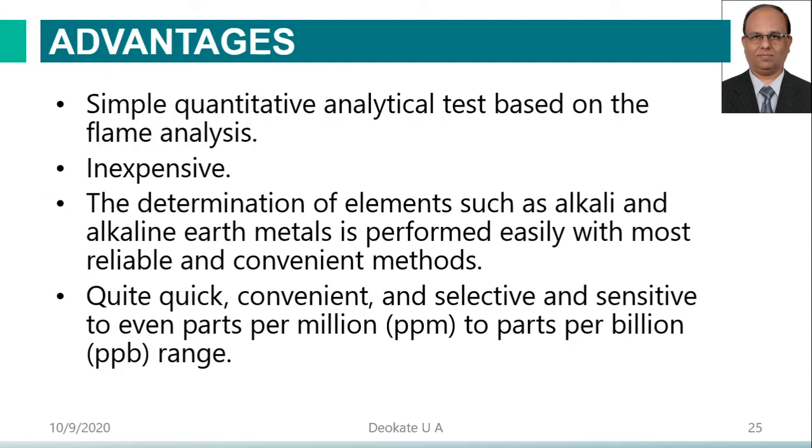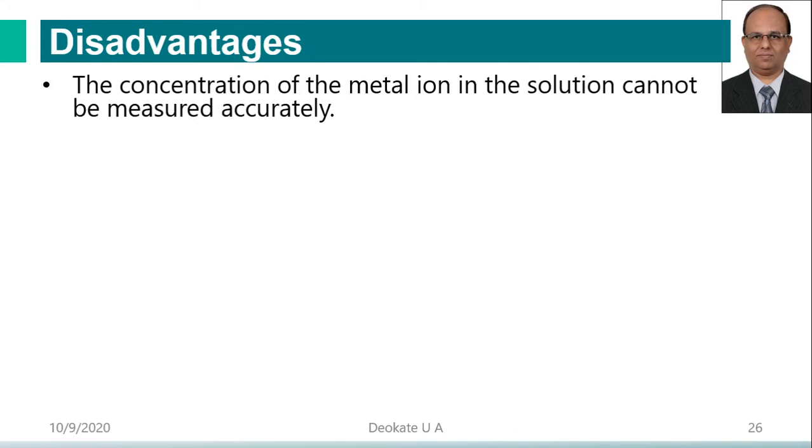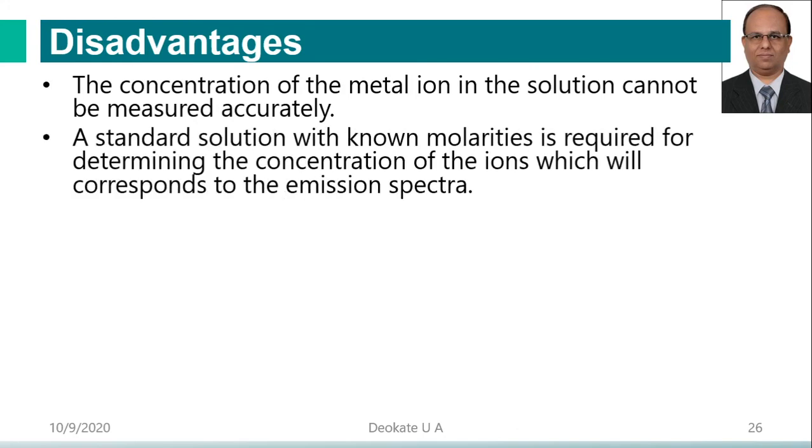It is sensitive, meaning a very small quantity of sample can be detected, even in the parts per million or even parts per billion range. So it is a simple, sensitive technique. But it has certain disadvantages: the concentration of metal ion in the solution cannot be measured accurately.